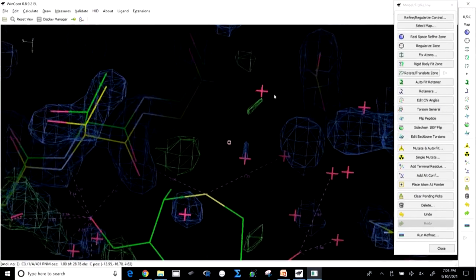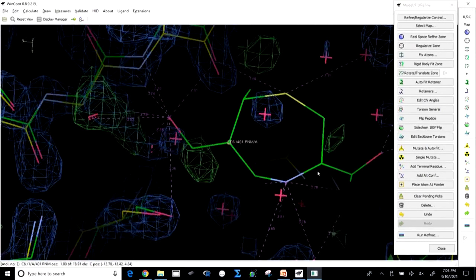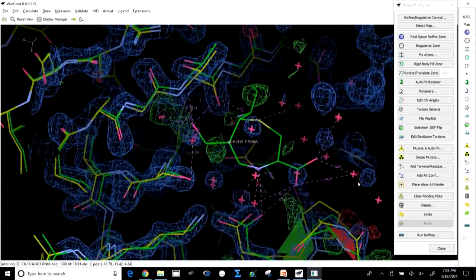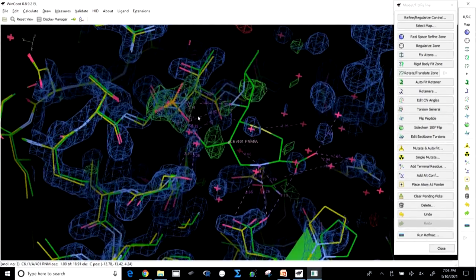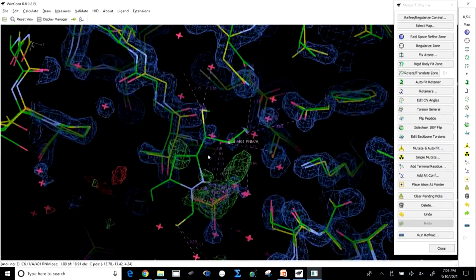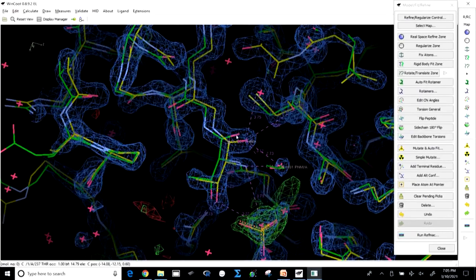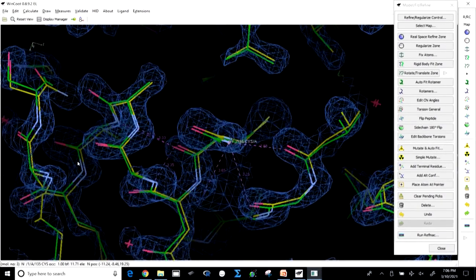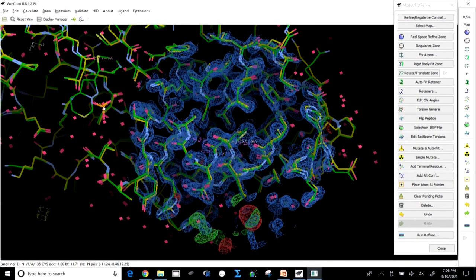You see the 7-membered ring, 1, 2, 3, 4, 5, 6, 7. You see the protein has a lot of interactions, right. Because of this interaction, there are changes in the position of the amino acids. That is what you could find: how they are different, how they are interacting. All these things you could get from here.